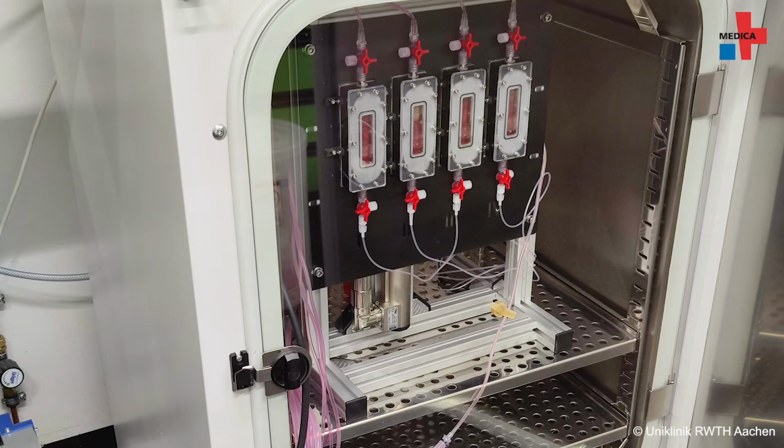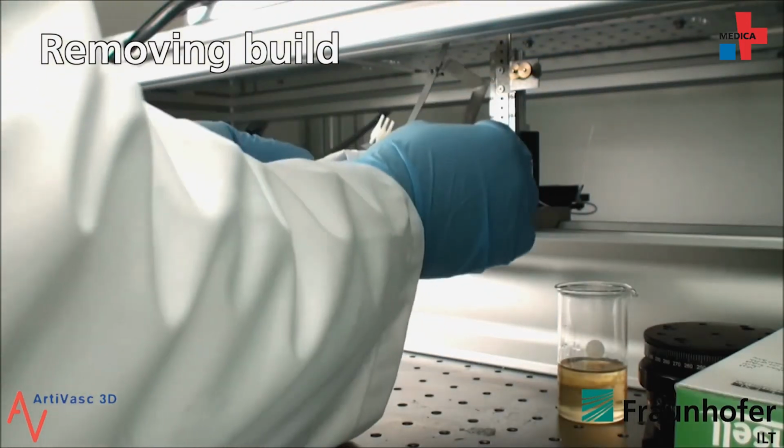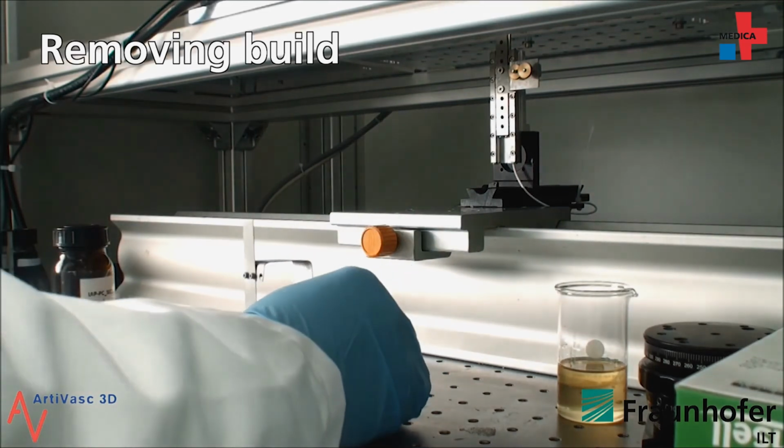With this bioreactor, we can stretch our cell-laden hydrogels. With this, we can, let's say, train the cells in the hydrogels in our cell culture lab for their future function in the organism.